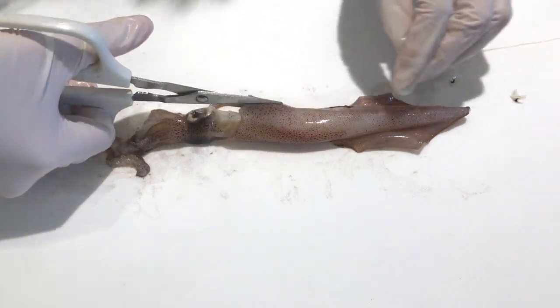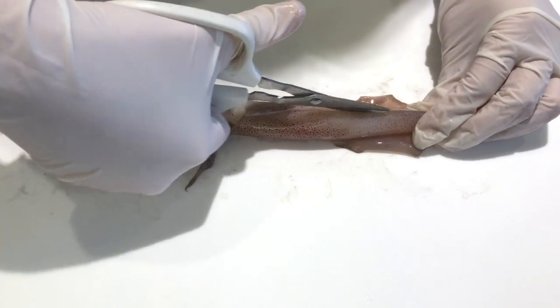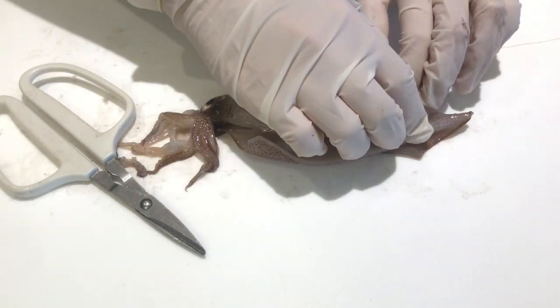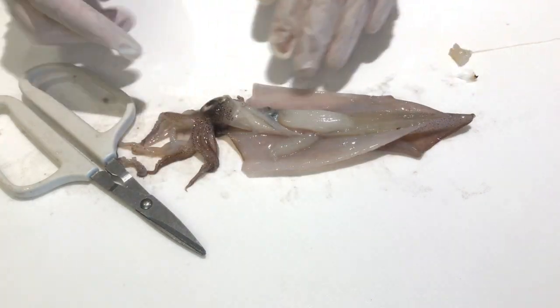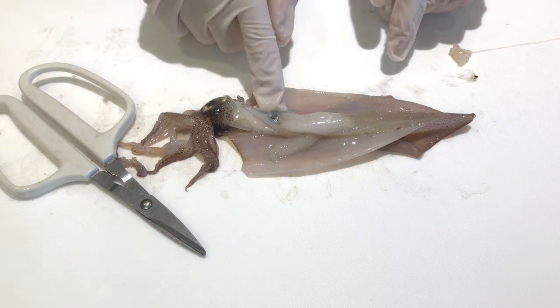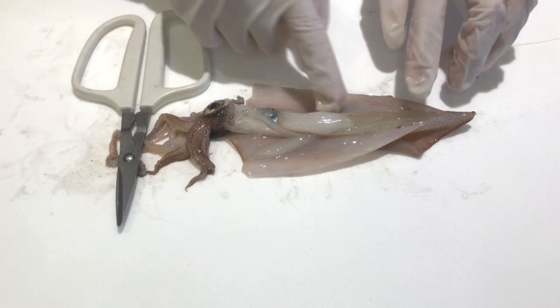So now I'm going to be cutting its back to show you the squid's insides. This large white structure is the liver. This is the ink sac. And those white structures on the sides are gills.